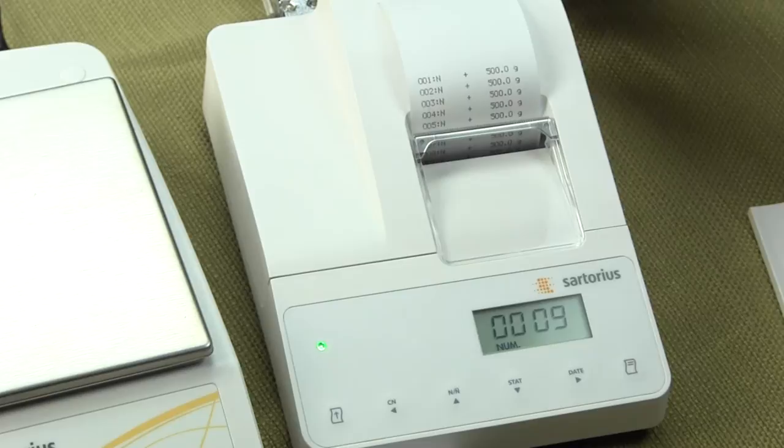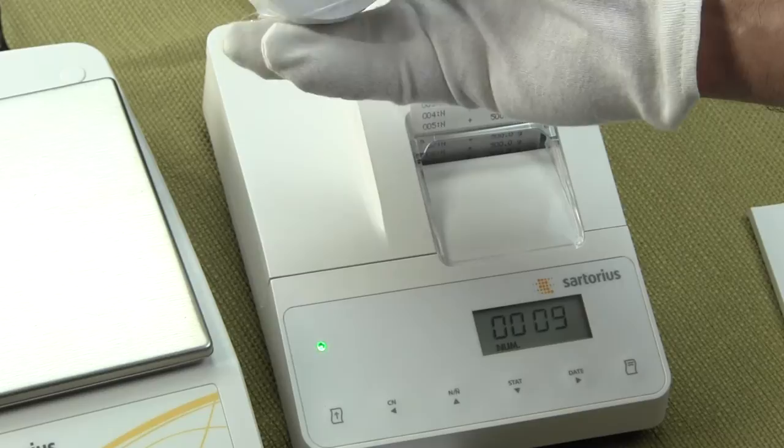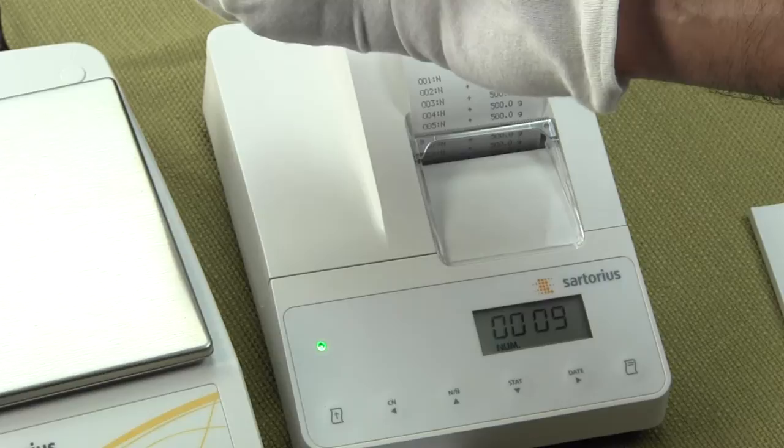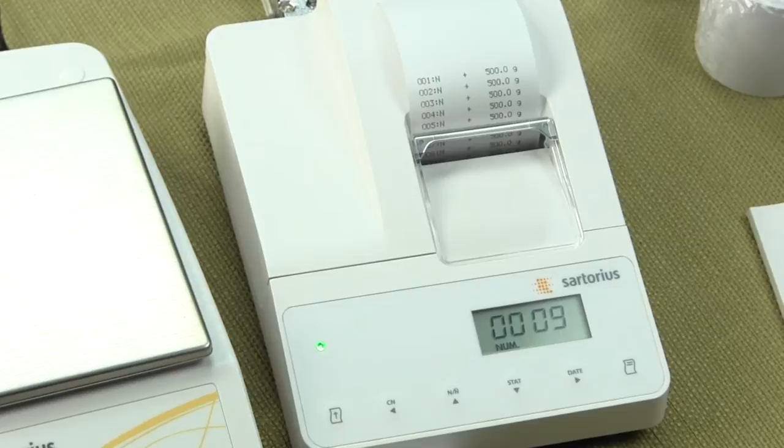A little bit about the paper: this paper is 57.5 millimeters wide and is sold in packs of five from Sartorius. This paper is not standard paper — we've never been able to find it in any office supply store, so you do have to buy it from Sartorius. Most paper in the U.S. has a honeycomb core, and this doesn't, so you can expect to just buy that from Sartorius.